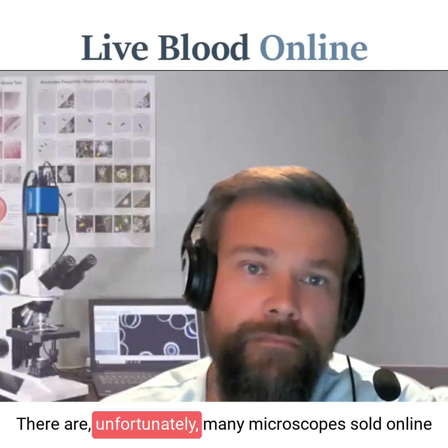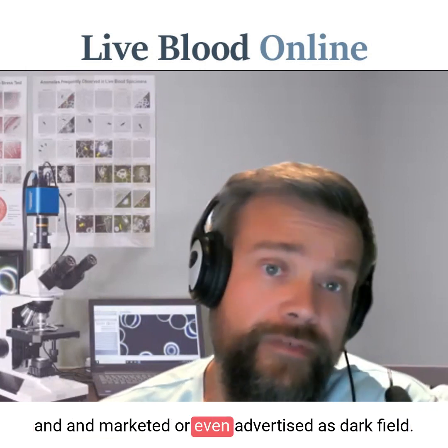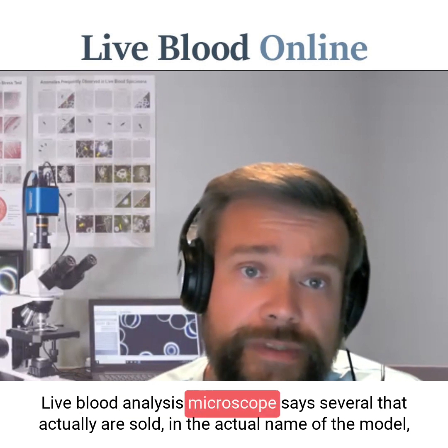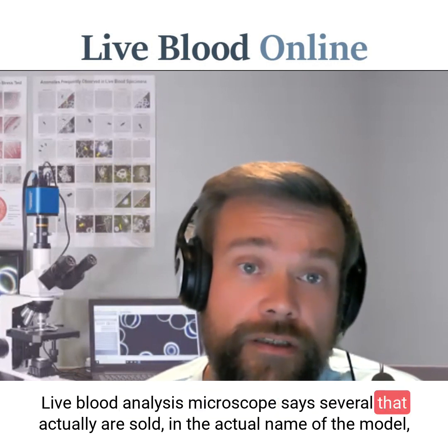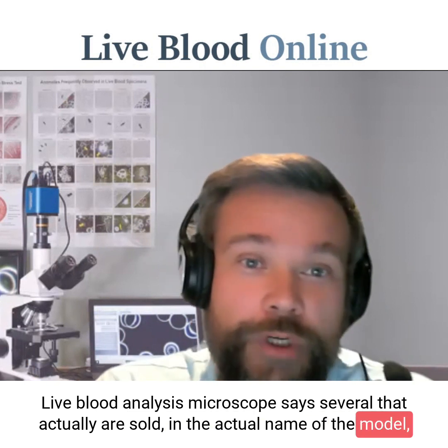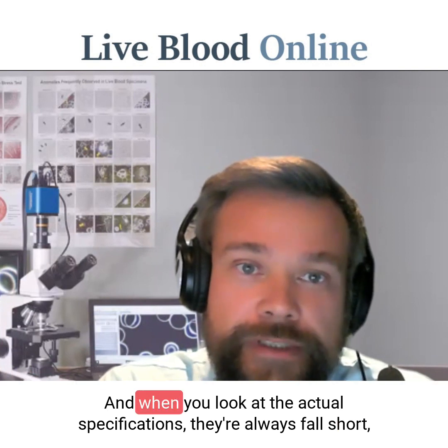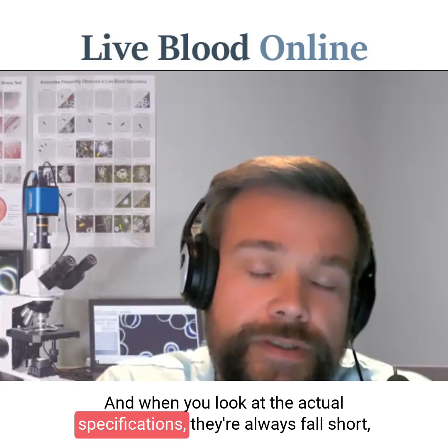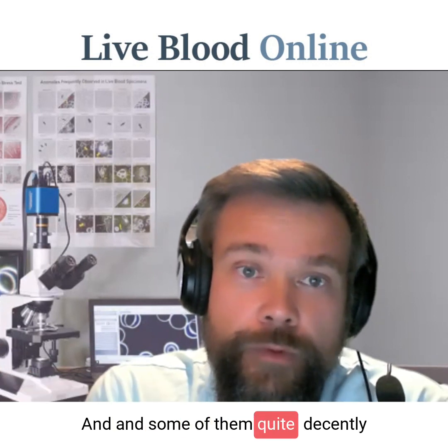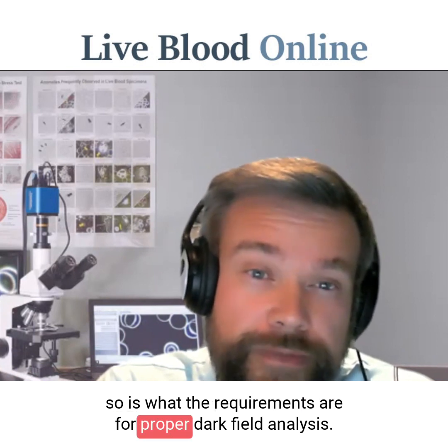There are unfortunately many microscopes sold online and marketed or even advertised as dark field live blood analysis microscopes. Several are actually sold with 'live blood analysis microscope' in the actual model name. But when you look at the actual specifications, they always fall short — some of them quite dismally — of what the requirements are for proper dark field analysis.